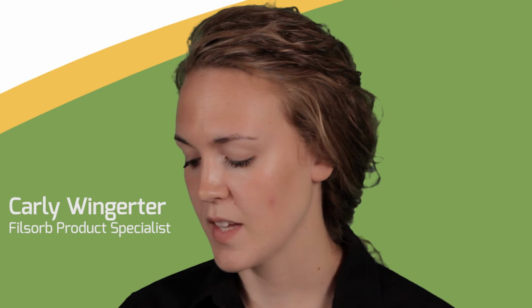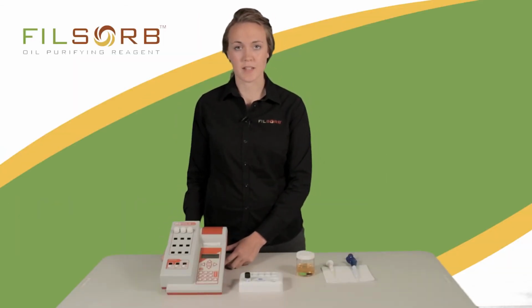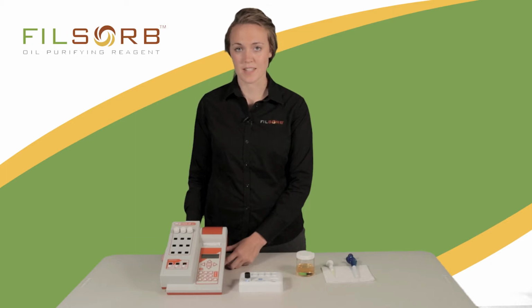This video will provide you with instructions to test for peroxide or PV value on food lab line analyzers. Today, we will be using the food lab fat, but this method applies whether you are using an oxytester S, or a mini food.